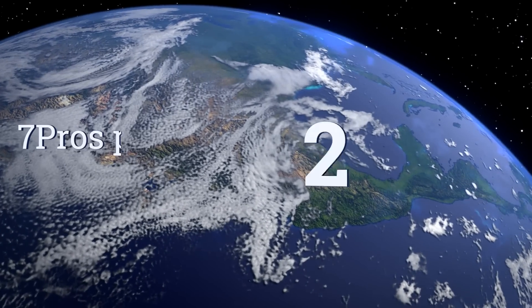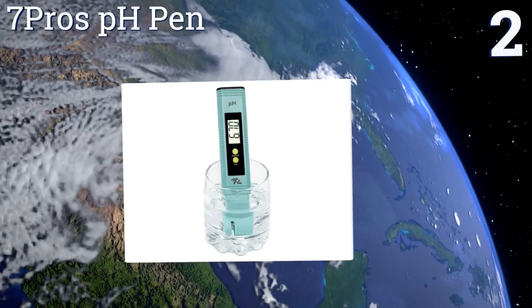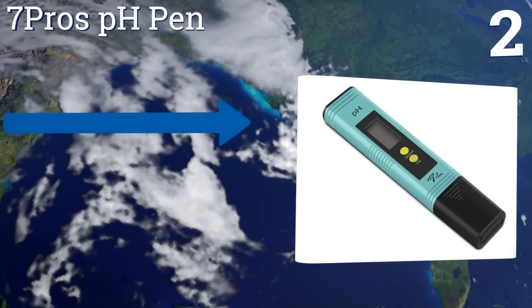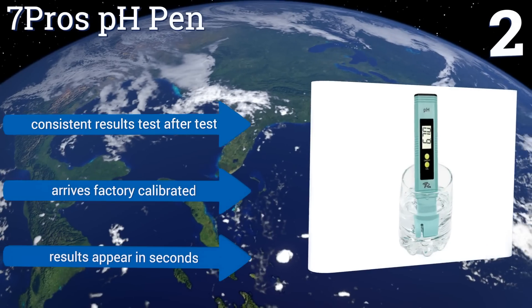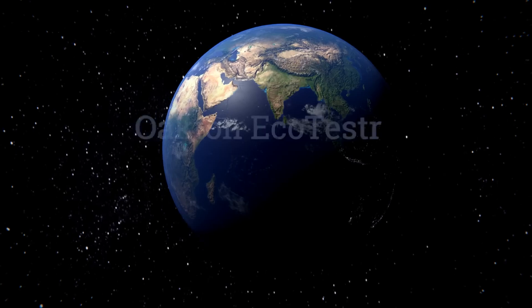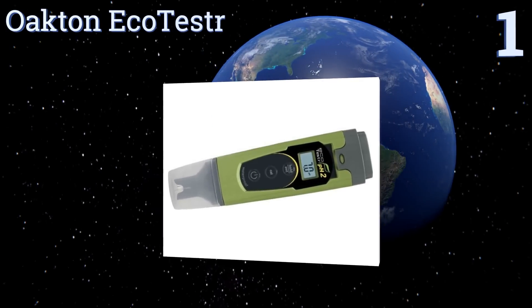At number two, with just two buttons to worry about — an on/off button and a calibration button — the Seven Pros pH Pen is extremely easy to use for beginners but accurate enough for experienced growers. It also makes a great pool water tester for homeowners. It delivers consistent results test after test, arrives factory calibrated, and the results appear in seconds.